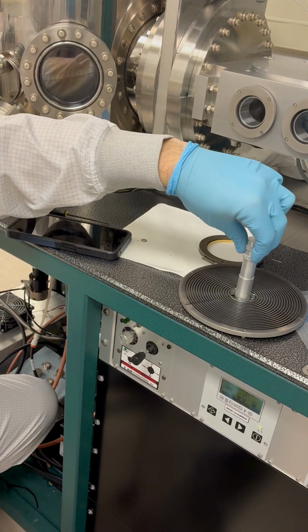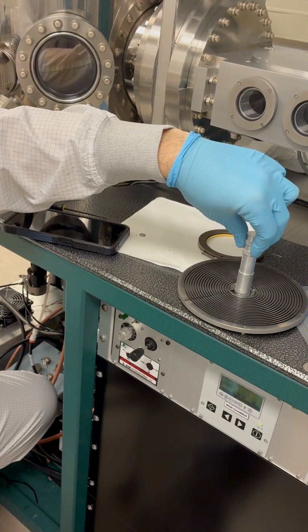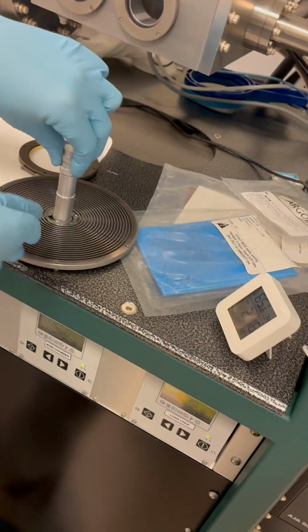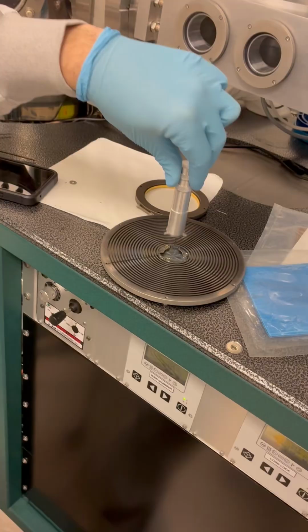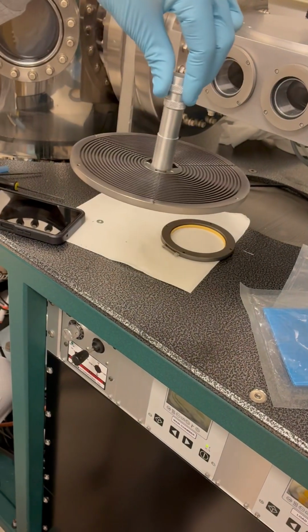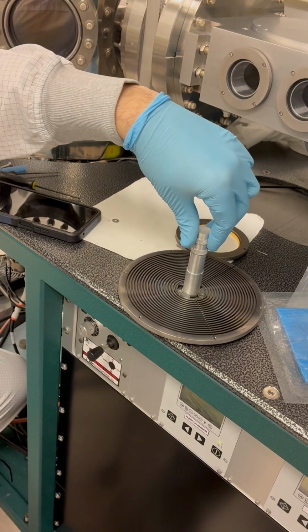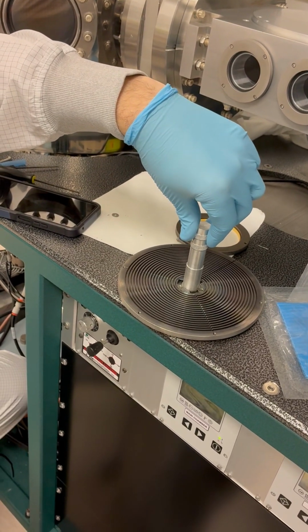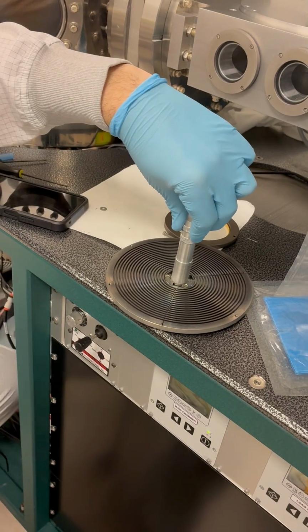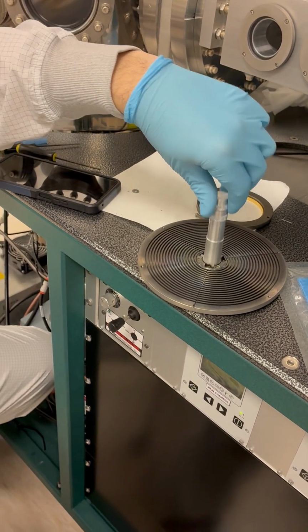If I was to rotate counterclockwise, what's it going to do? It can fall right out, and it's not going to be in position. And so I always like to start out a little bit counterclockwise from where I want to be, so that I can then rotate it intentionally in the correct direction and it should fall into place. Does that make sense? Okay.